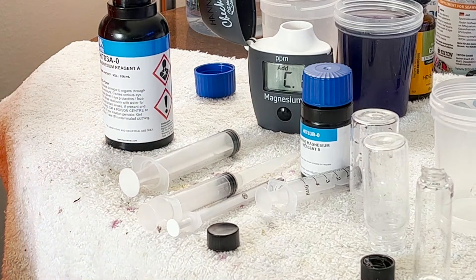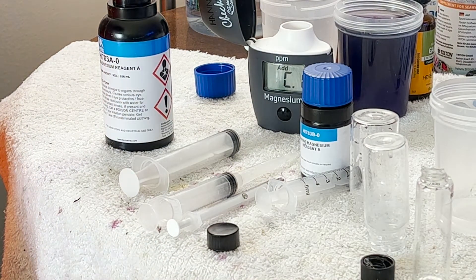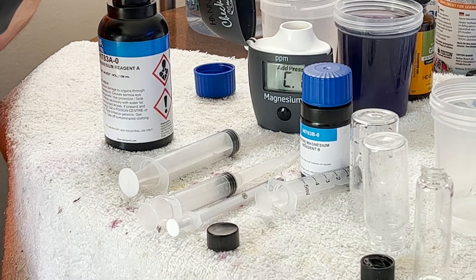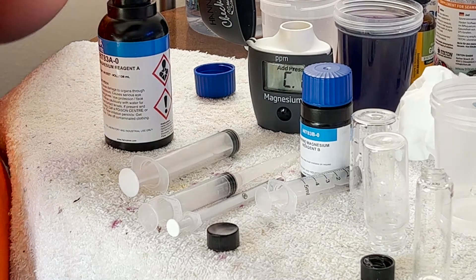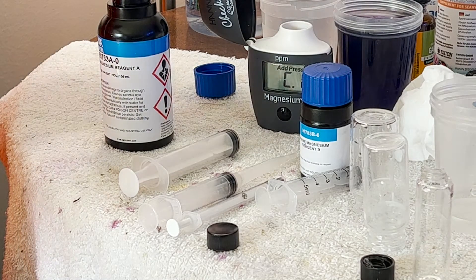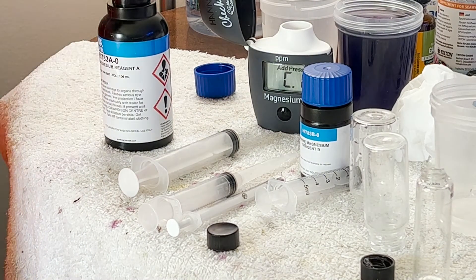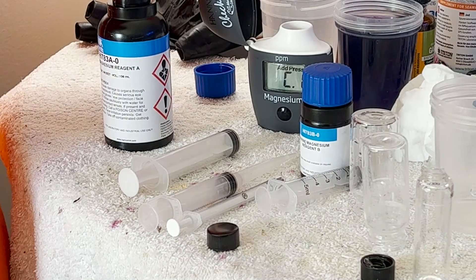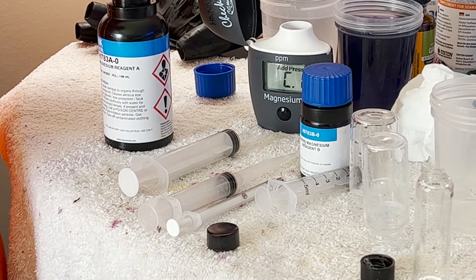I also have reagent all over me, which is even better. We'll use a tissue for this. That ain't working. We're going to ditch that one. I'm going to change gloves. Now I'm just covered in the reagent.